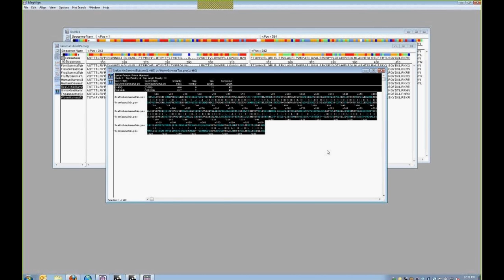And again, with anything that you do for assembly purposes, whether it's selecting a region that you want to align or selecting the algorithm that's aligned, these are decisions that you as an individual researcher will have to make and justify. So for making a tree that looked a little bit better, we selected the first 400 residues. If you're not sure, we would always recommend just using the entire sequence information for your trees. Just for justification purposes. Great, thank you.